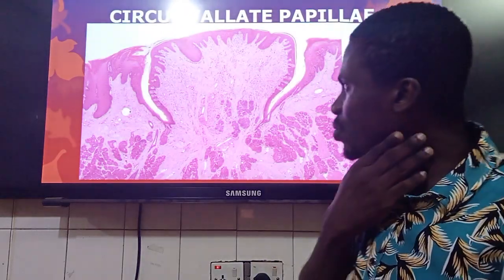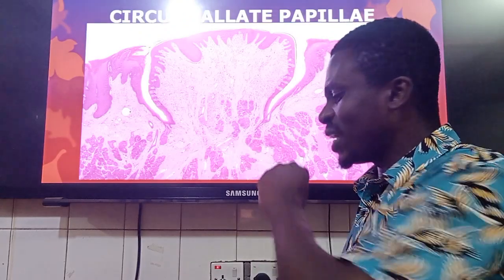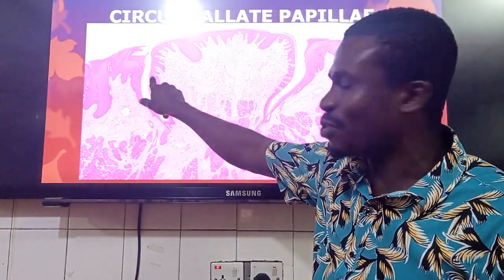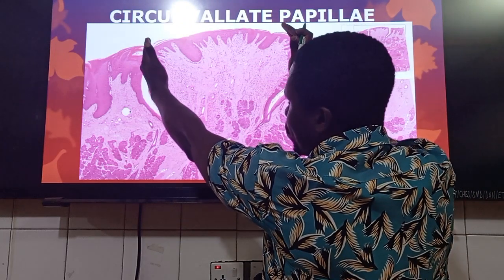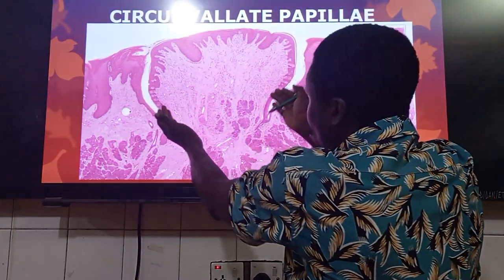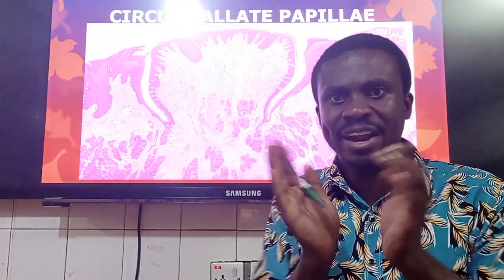And my friends, one useful thing I want you to also know is that I'll be showing you another papilla. That one will also have the taste buds located on a lateral wall. So my friend, how do you distinguish them? Almost always, in the craniocaudal direction, from superior to inferior, the lateral walls appear to be convergent inferiorly. That's what we see.